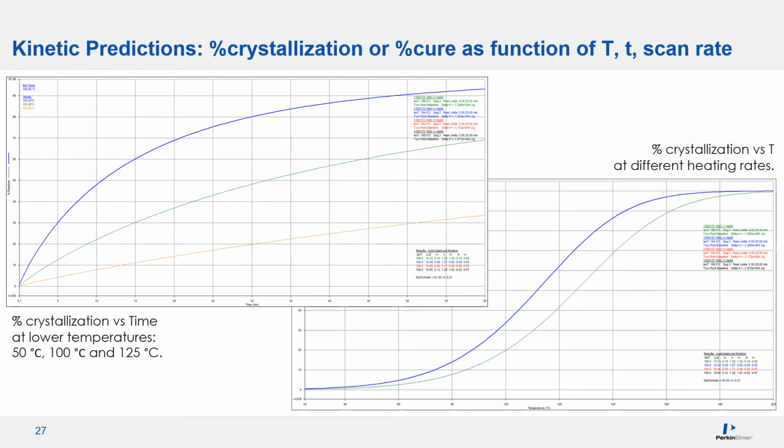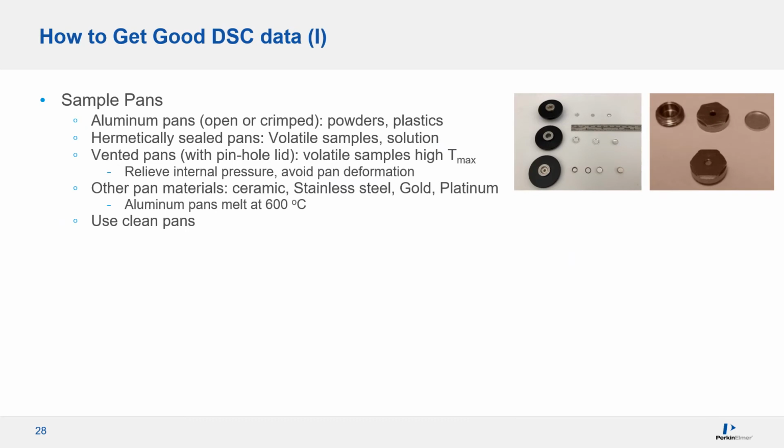The same method can be used in curing analysis. It helps design or optimize processing conditions, such as the cure temperature, time, etc. This saves both time and cost. We have covered a lot of DSC applications. That's not all for sure, but maybe enough to get you more interested in it.